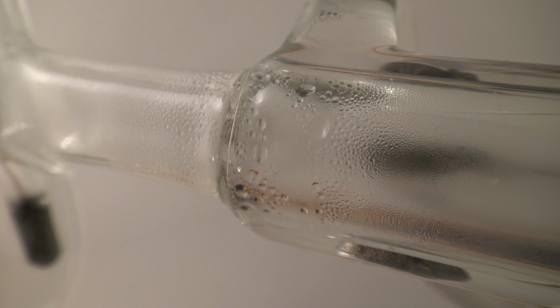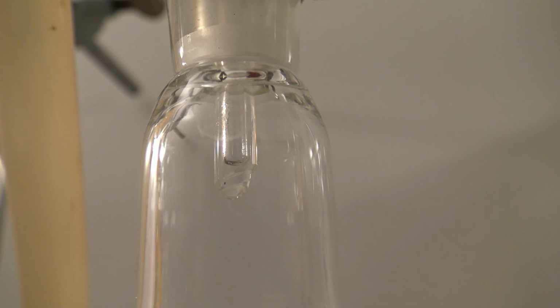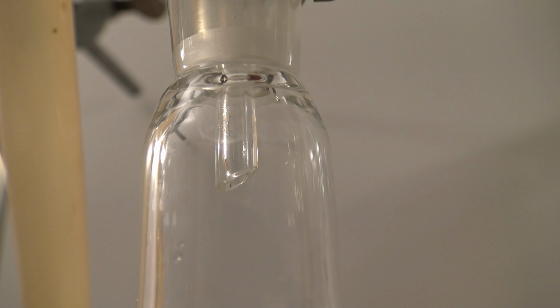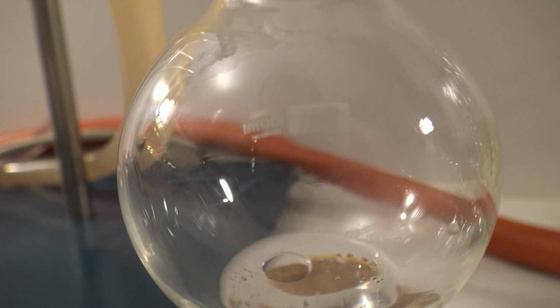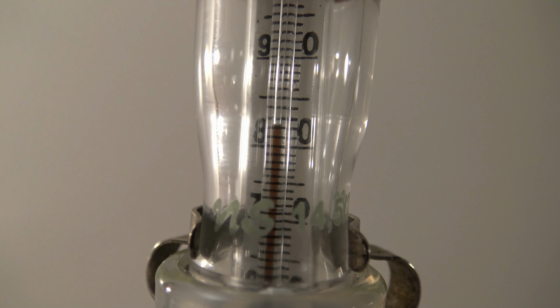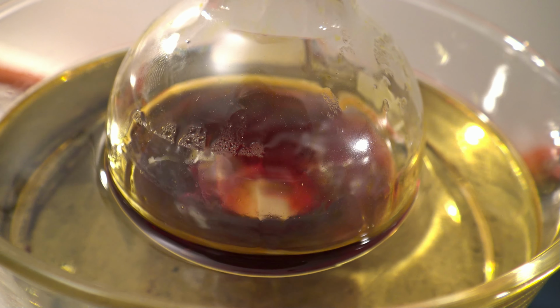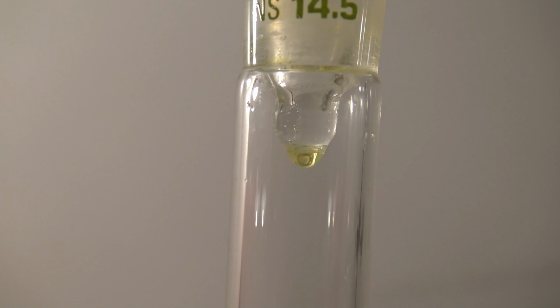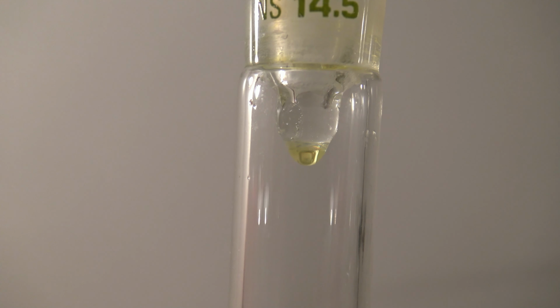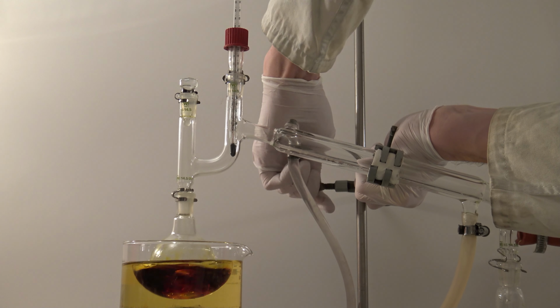After a while, first droplets formed on the surface of the apparatus. At first, different compounds were distilled off, while the boiling point did slowly rise from 80 degrees to 85 degrees C. Then the boiling point dropped significantly before rising over 100 degrees C. At the same time, a yellow oil did condense in the apparatus, which could have been the product. So the distillation was stopped again.